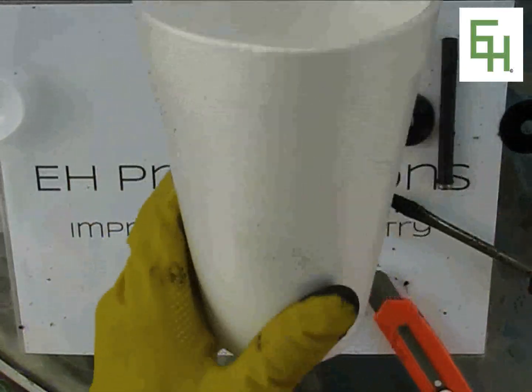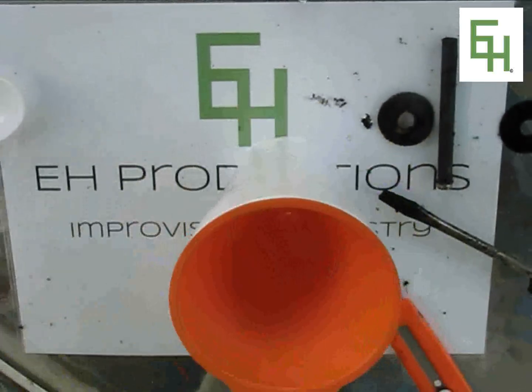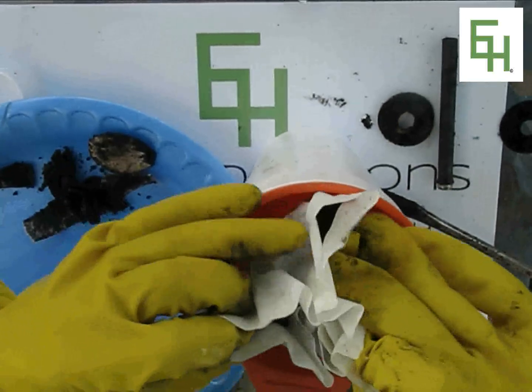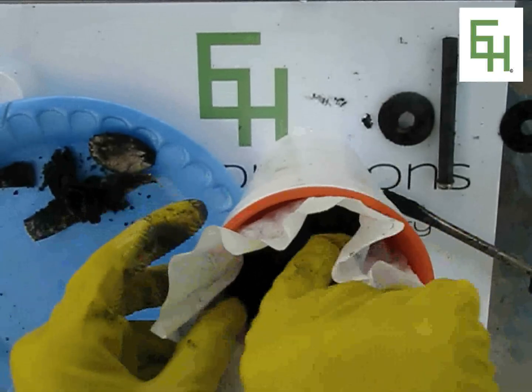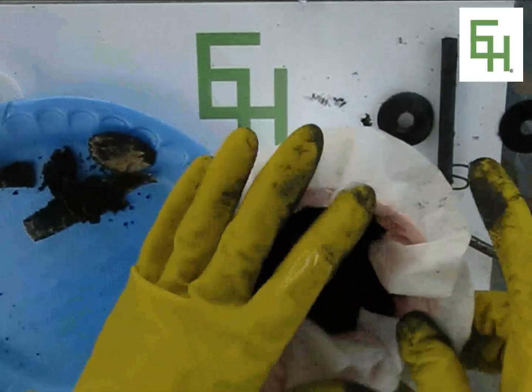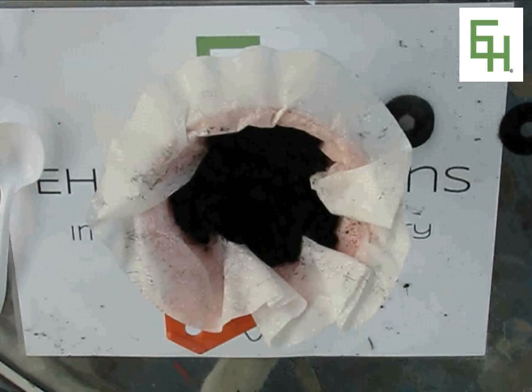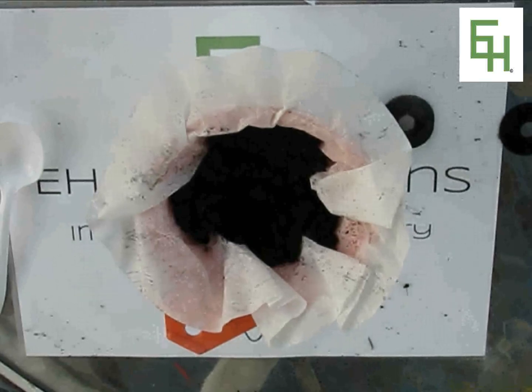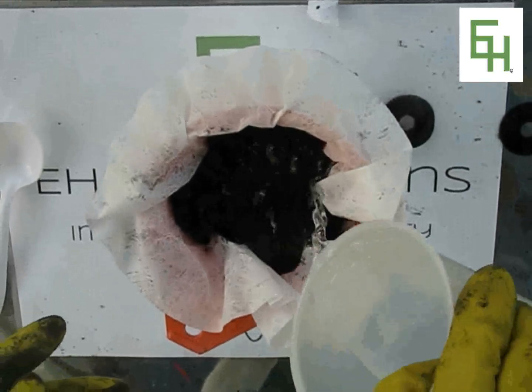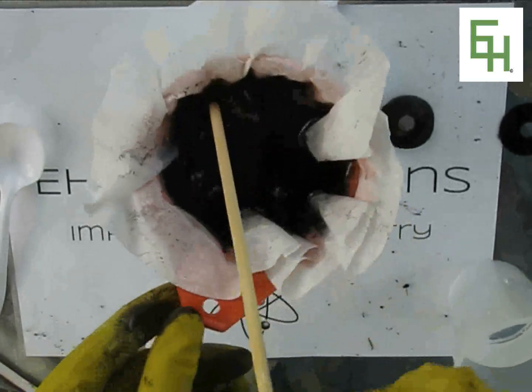I've got a regular styrofoam cup and a plastic funnel. We're going to put the funnel right on top just like that. I'm going to go get some water to rinse this off. I got a bucket of water — we're just going to rinse this, pour water on it through the coffee filter, and just stir it.